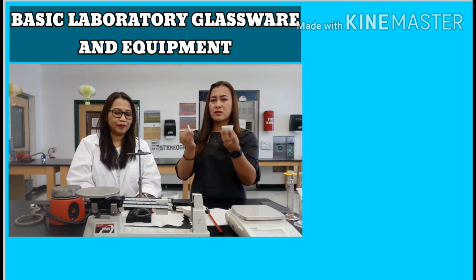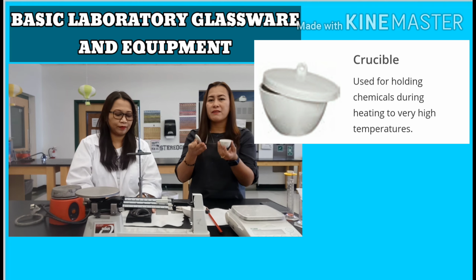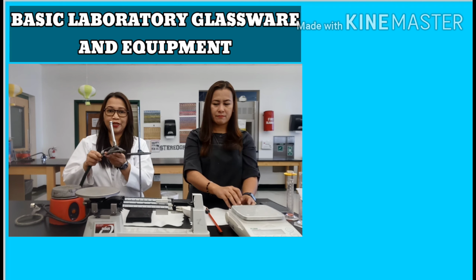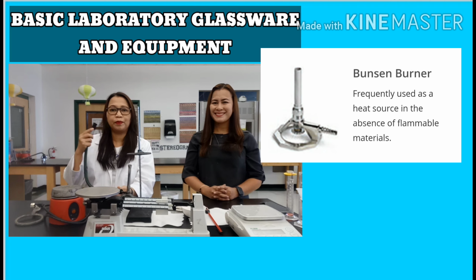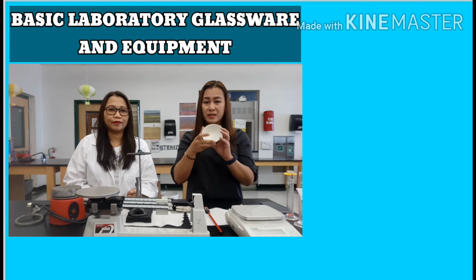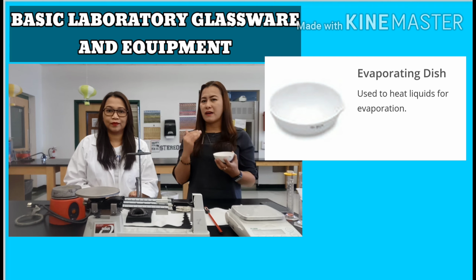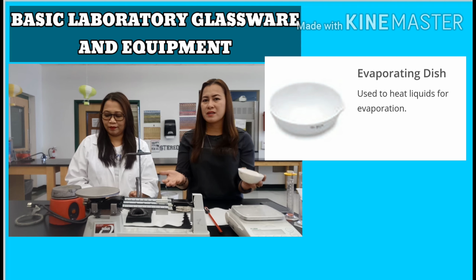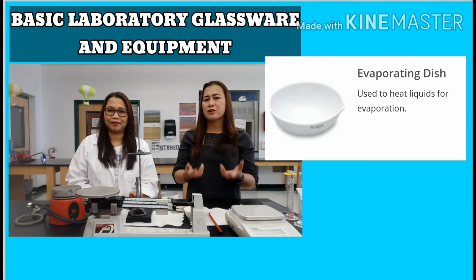So we have here the crucible and cover. This is used for holding or heating chemicals at very high temperature. And then we have here the Bunsen burner. The Bunsen burner is frequently used as a heat source in the absence of flammable materials. We have the evaporating dish. Evaporating dish is used for substances under the evaporation process. So you could put your specimen over here and leave it for a certain period of time, and you can observe your specimen or your samples as it undergoes evaporation.